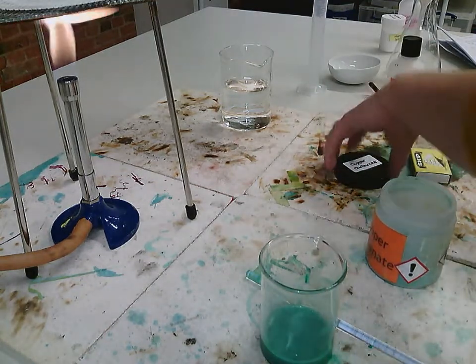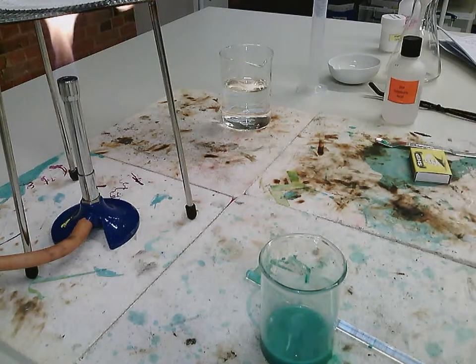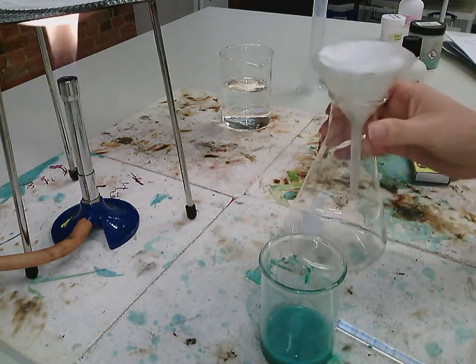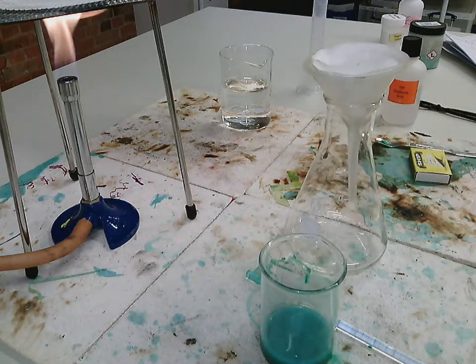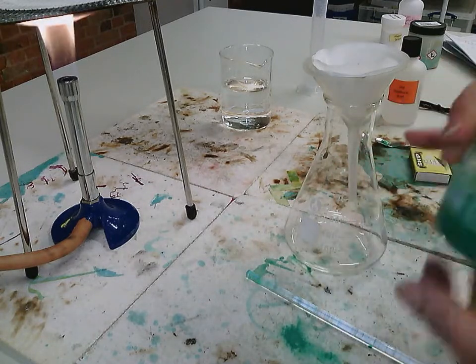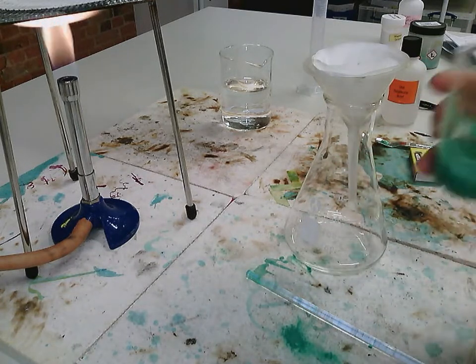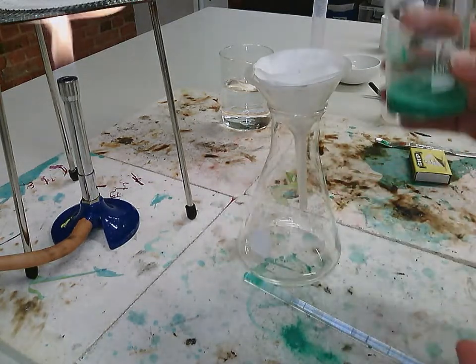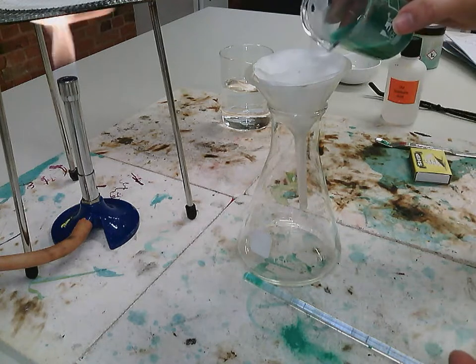One of the reasons we need to fully react it is to get rid of the acid, because we're going to be heating the acid and carbonate solution up to form crystals. And you don't really want hot acid. That's just going to make the acid a whole lot more dangerous. And also when we make the crystals, we want to be able to touch them, and if there's dried acid, that will form white crystals and they won't be safe to touch.